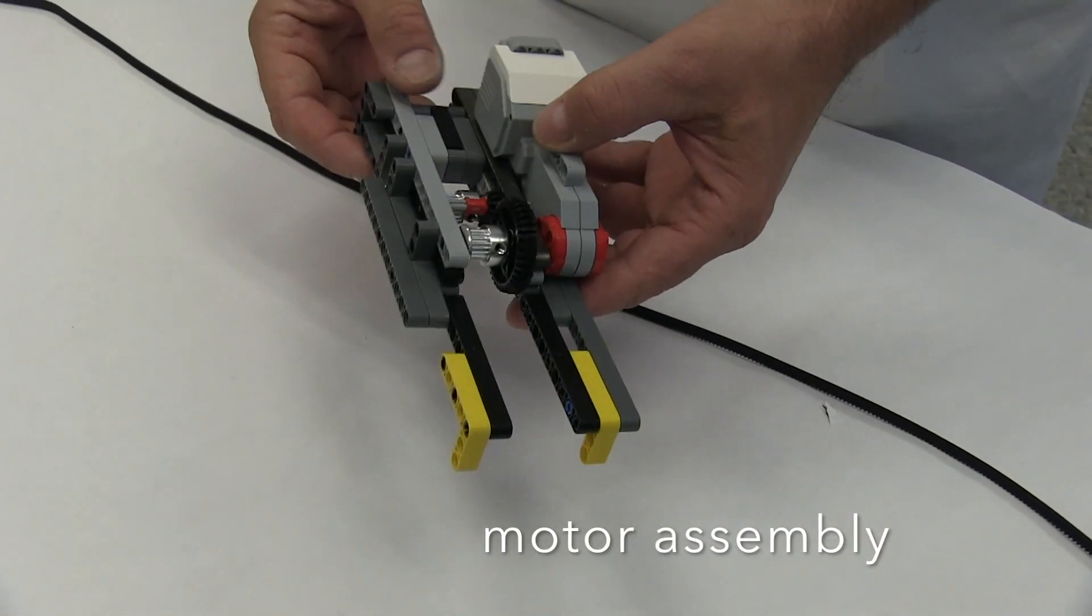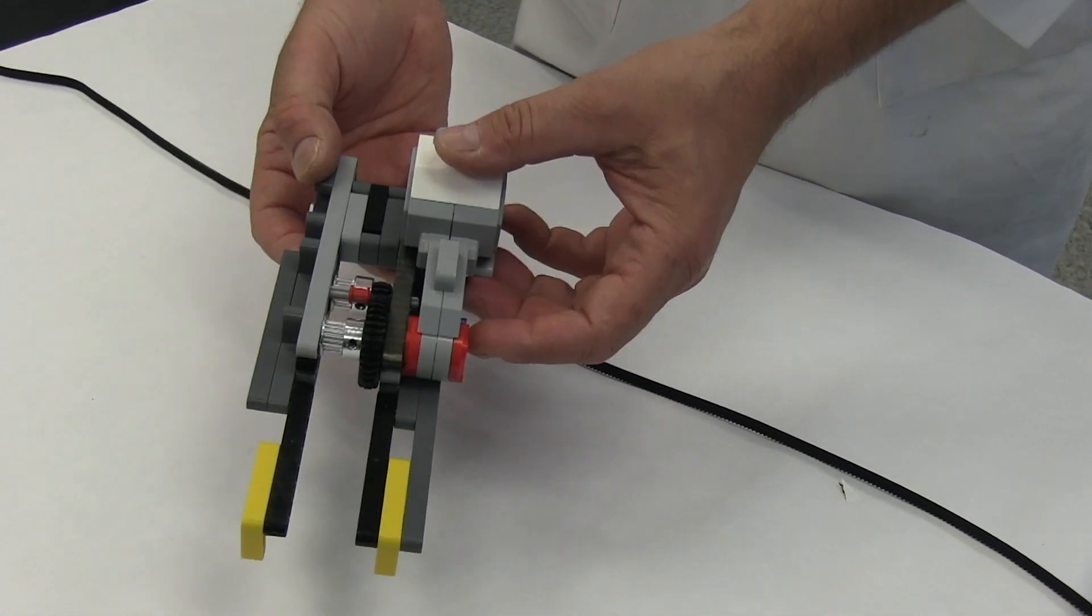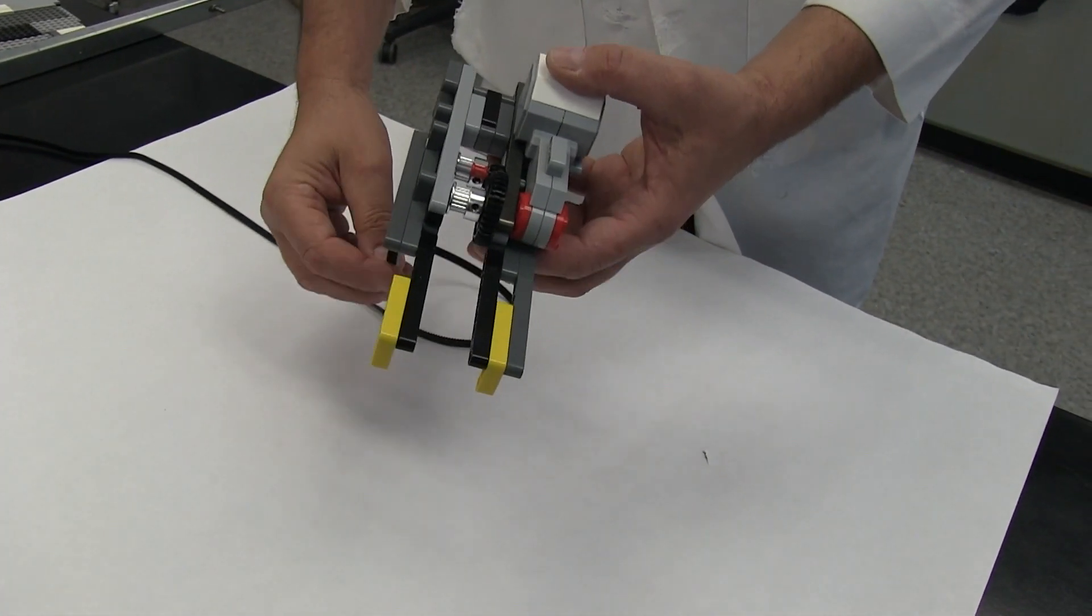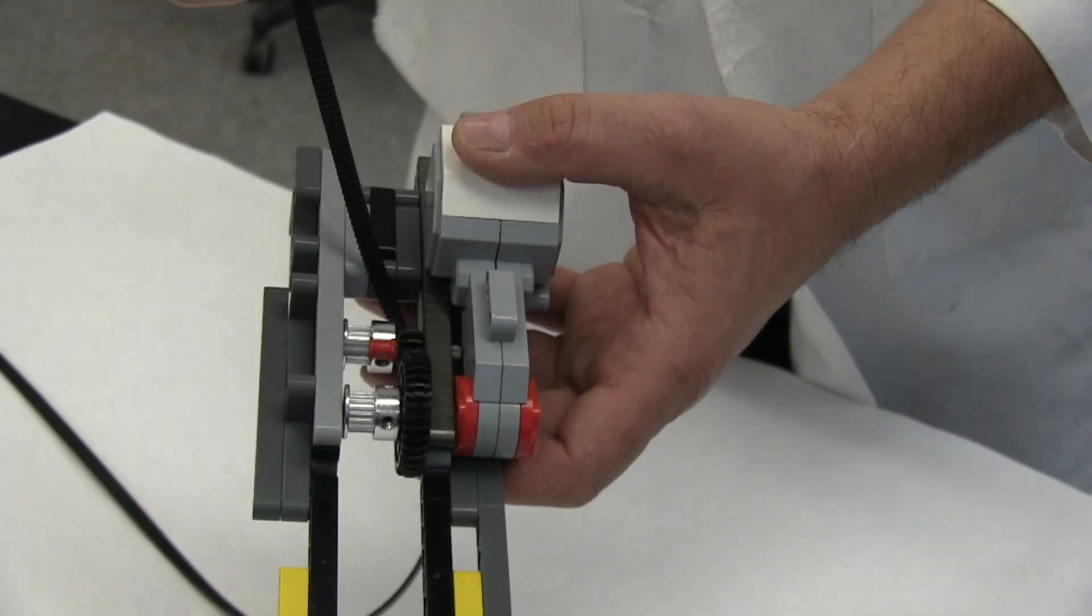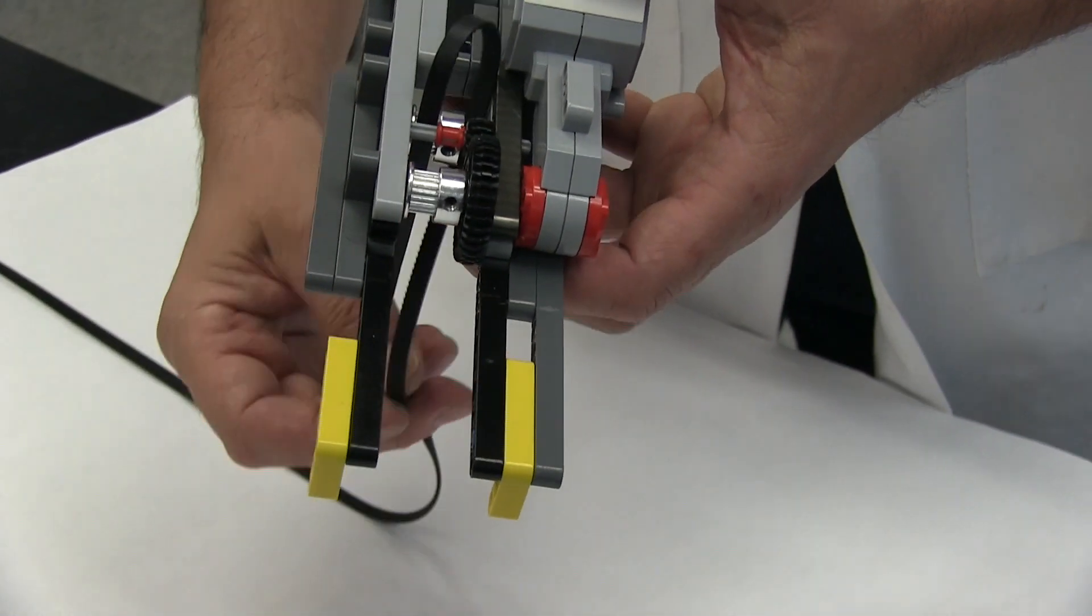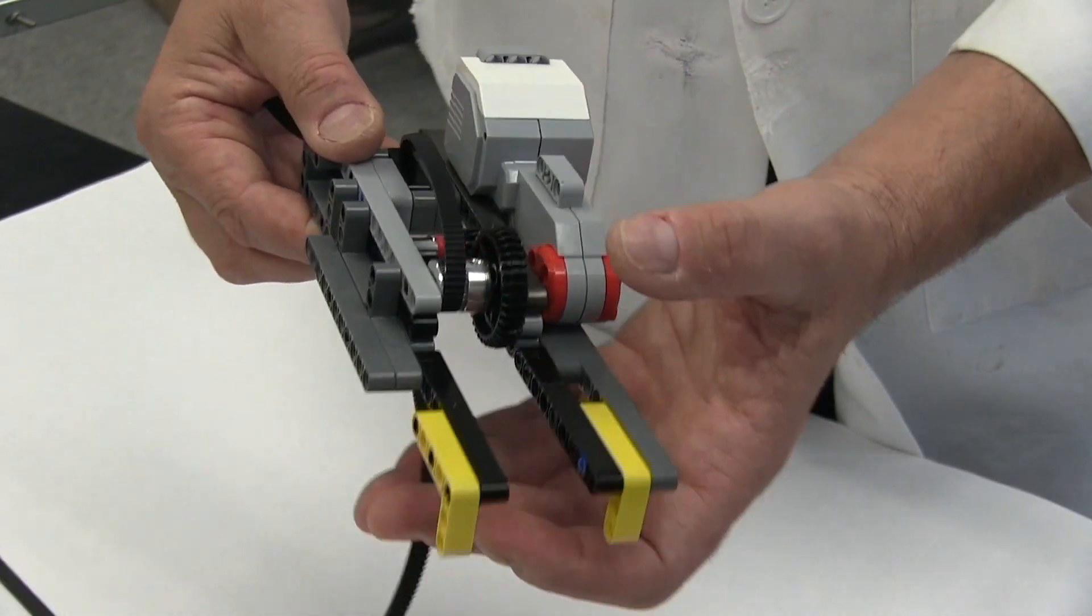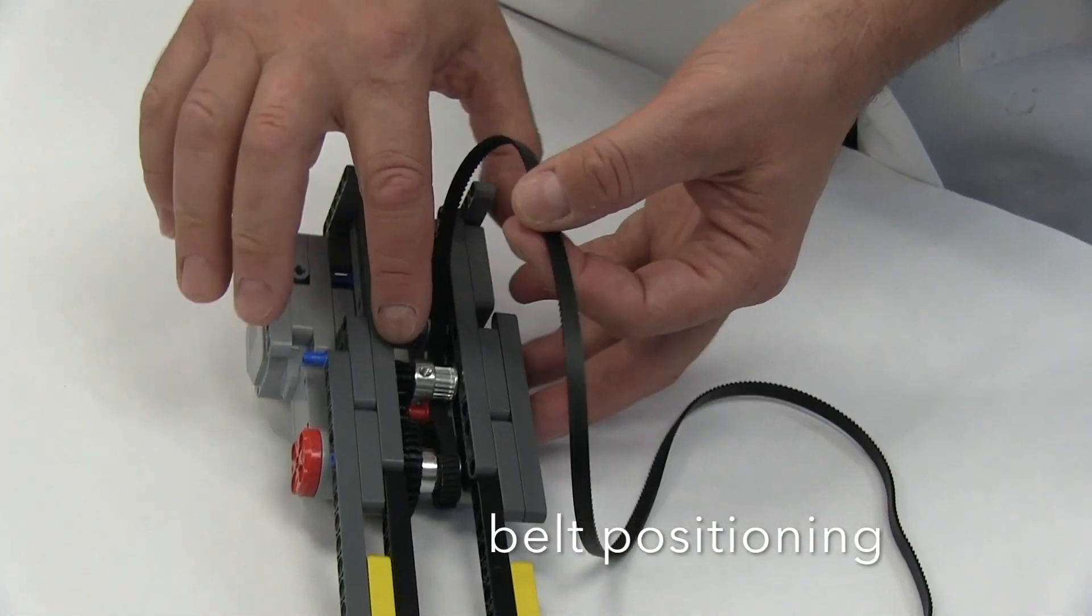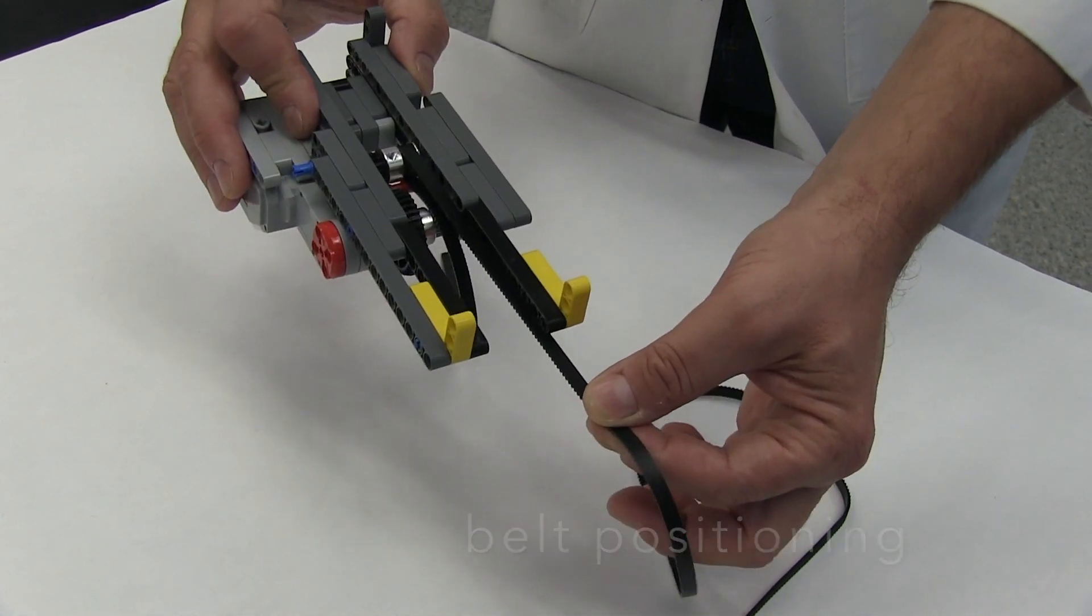We'll begin by showing you how to install the belt into the motor assembly pulley system. This will slide the robotic arm left and right on the fraction collector platform. Here we are positioning the belt onto the pulley such that it grips the gears in the motor assembly unit.